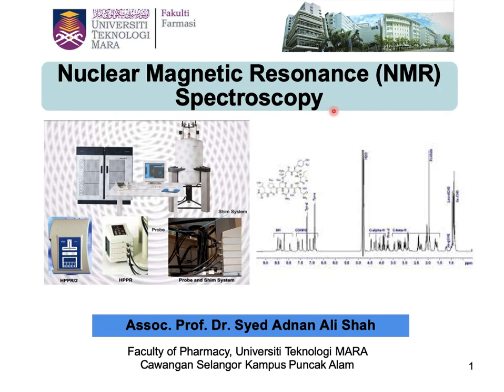So it doesn't use any of the radiation from the electromagnetic spectrum. But in the case of nuclear magnetic resonance spectroscopy, it uses radiation from the electromagnetic spectrum.